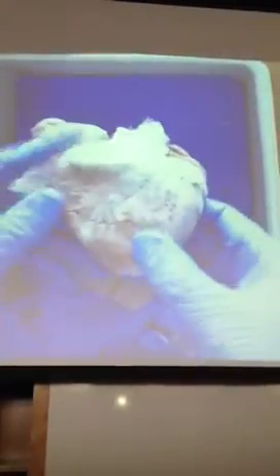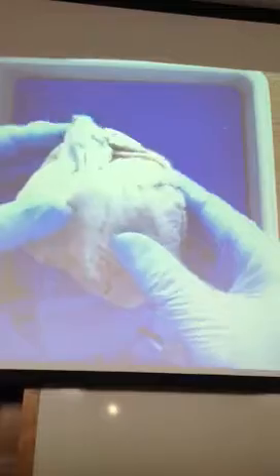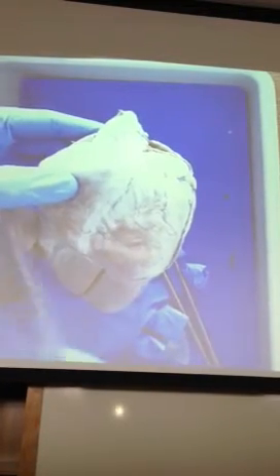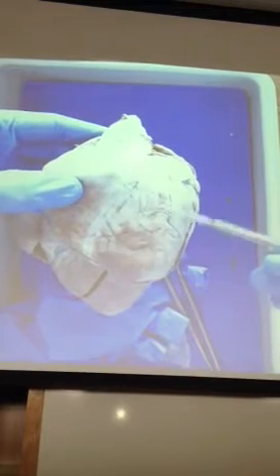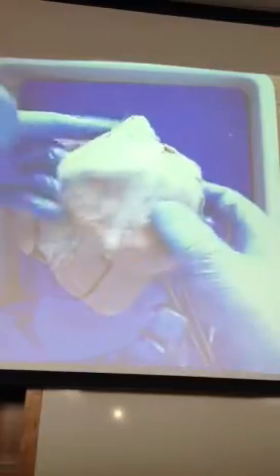Anyway, so this is the anterior surface of your sheep heart. Remember, you can see that fat going in a stripe across the side like that. That's your anterior interventricular sulcus. It contains a little groove. Inside of it is your anterior interventricular artery, one of your main coronary arteries. And there's fat over it, which makes it look like that.